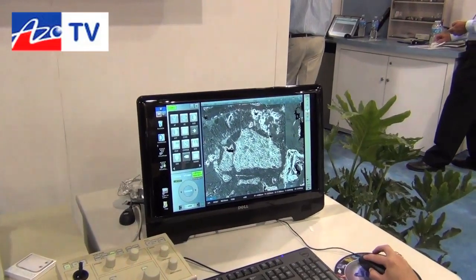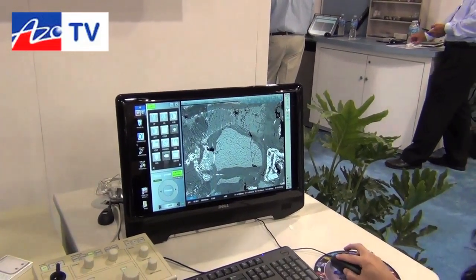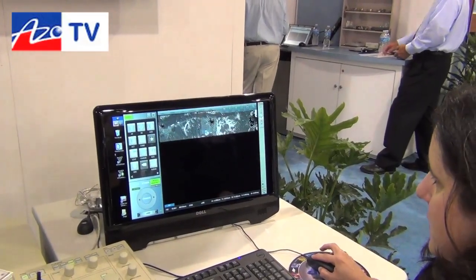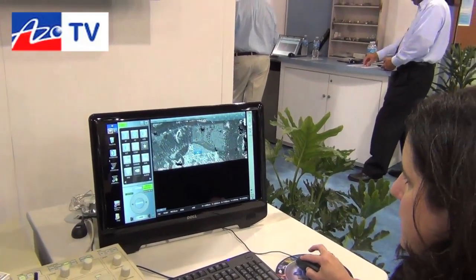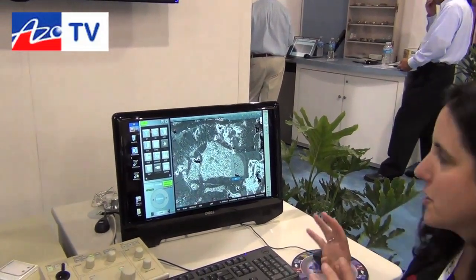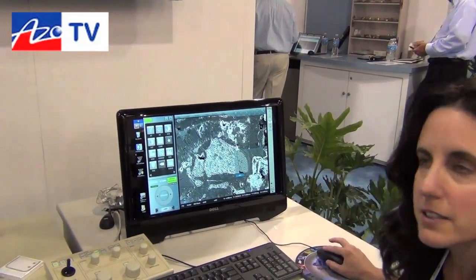I have one field of view that I can split any way I like. I can present a field of view this way, or even do a picture-in-picture view where I can resize and move things around to get an understanding of the composition of different areas.